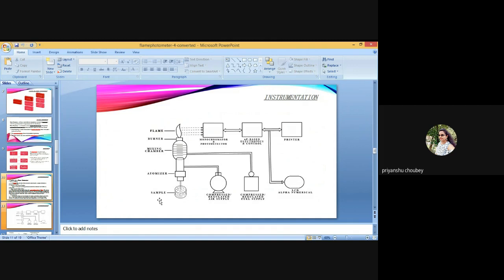Types of colorimeter: absorption photometers may be classified as visual comparators, filter photometers, and spectrophotometers. On the basis of their construction, they could be either single beam or double beam type. Also, the instrument may be a direct reading type or based on a balanced circuit.